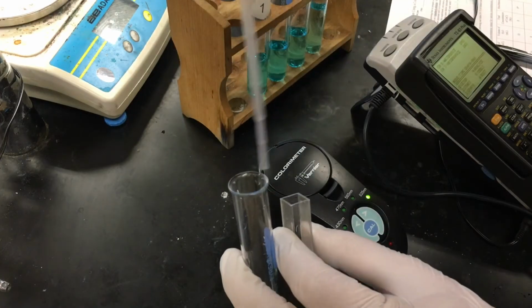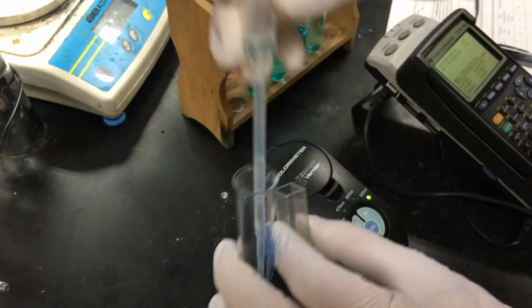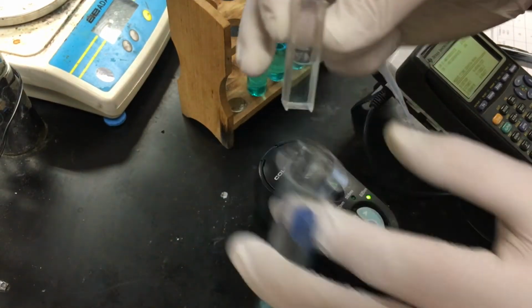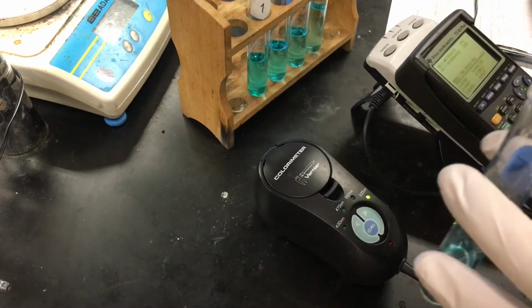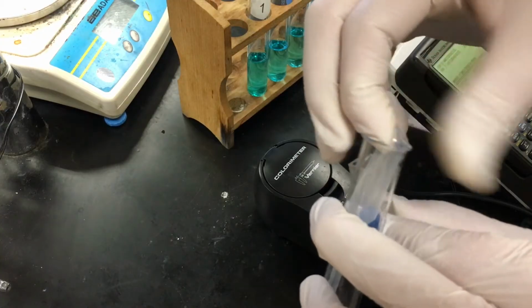And what we're going to do is fill the cuvette with that solution. And this is just a rinse. We're going to discard that, and then we will fill it up again.